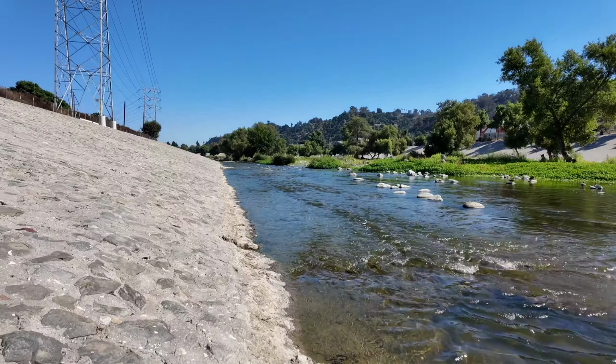So next, I'm going to move to a part of the river where there's a little bit more movement, where the current's higher, and see what that TDS value is. And when I get there, I'll let you know.